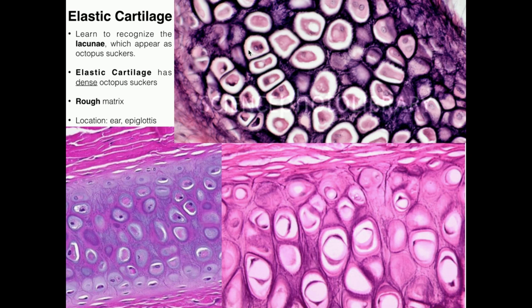The better way to tell the difference between elastic and hyaline is that in elastic cartilage, this matrix outside of the lacunae — every space here that's not occupied by lacunae — is very rough looking in appearance. Even if you look down here, you can tell it looks like there are a lot of scratch marks. So in elastic cartilage, the matrix is a lot rougher.